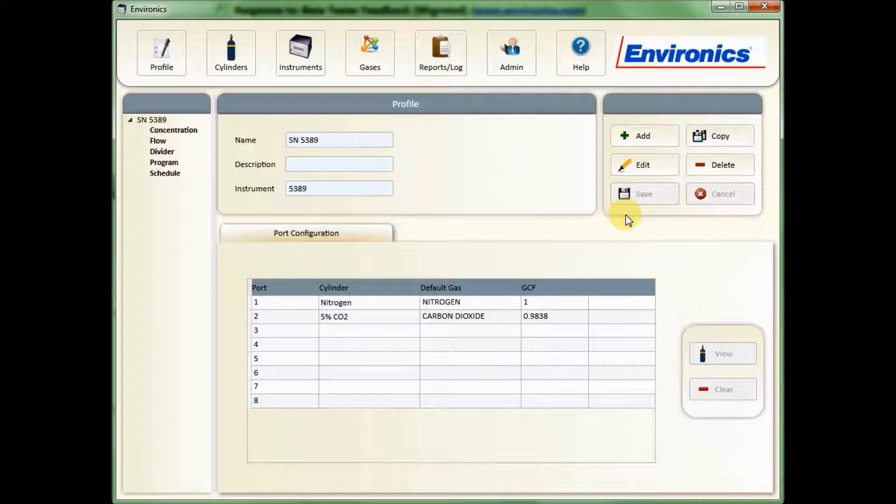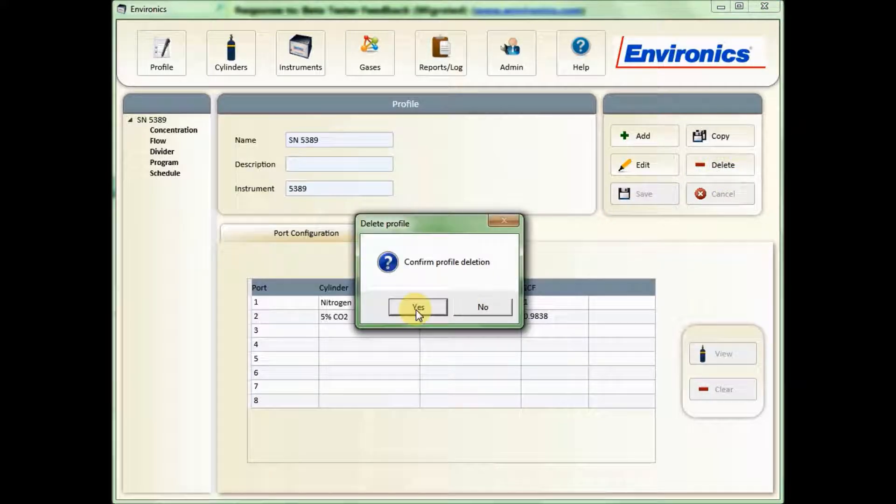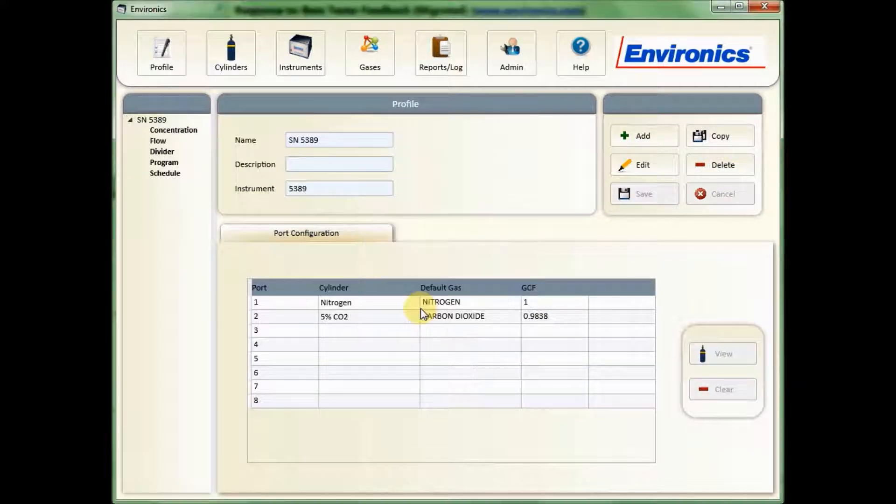If you want to remove the profile entirely, if the unit is no longer used, for example, you hit Delete, and that will ask you to confirm, and that will let you just delete the profile.